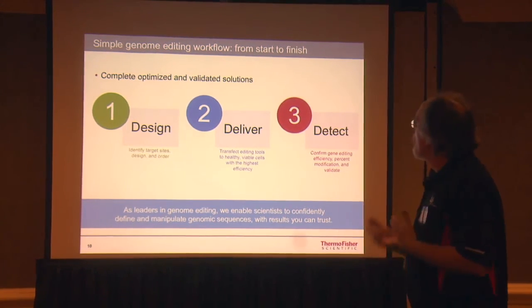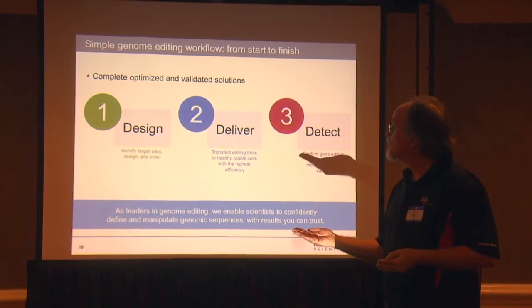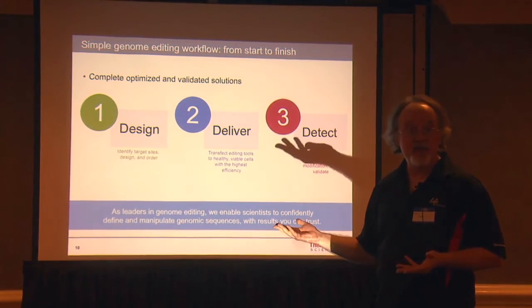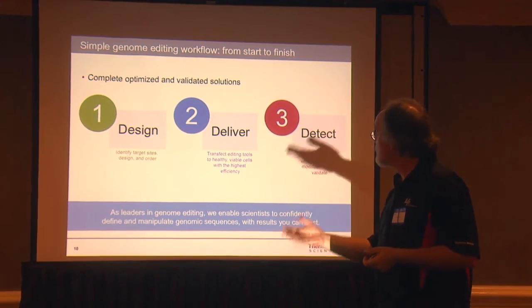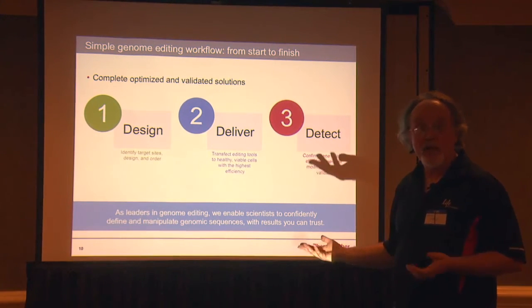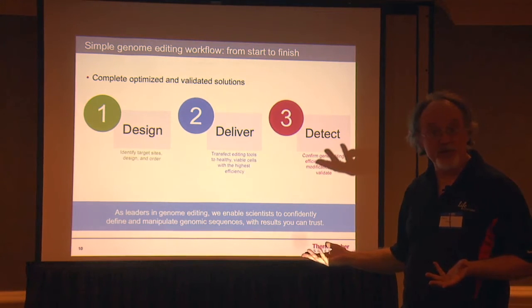So what I'm going to do is basically explain parts of our genome editing workflow, particularly where the software comes into this, and talk about how we use software for design, delivery, and detection of what happens when you're using CRISPR designs.